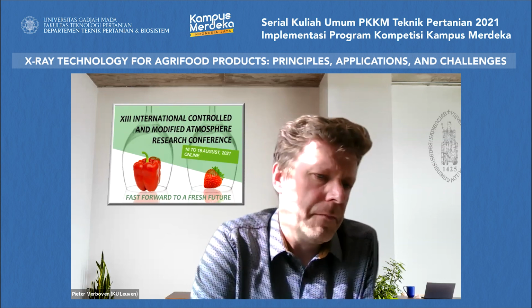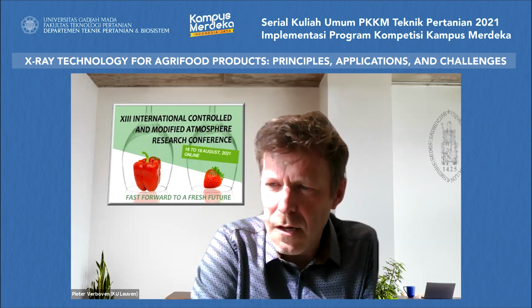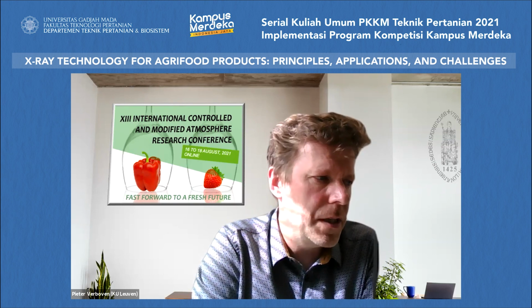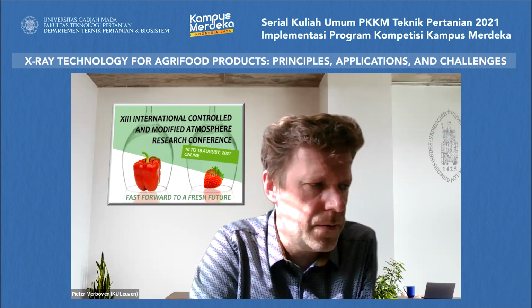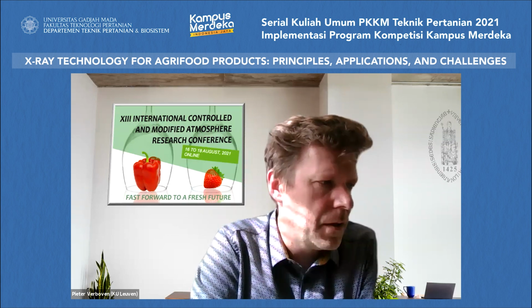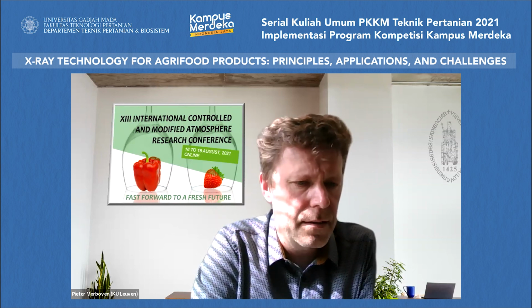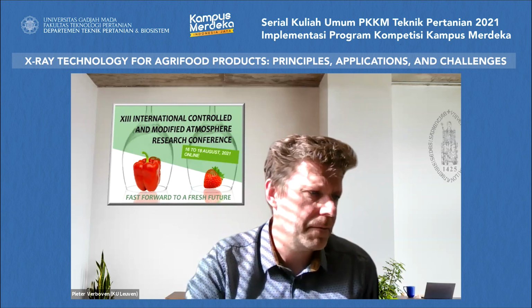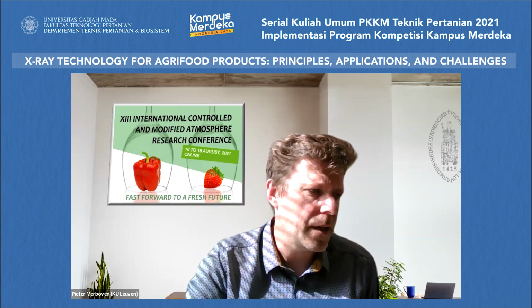So there is where the applications are today for this methodology, not in the fancy three-dimensional imaging. That is still too expensive and too time-consuming for the applications that you talk about. But for inline scanning, we see a lot of prospects of applications happening for internal quality assessment of agri-food products.